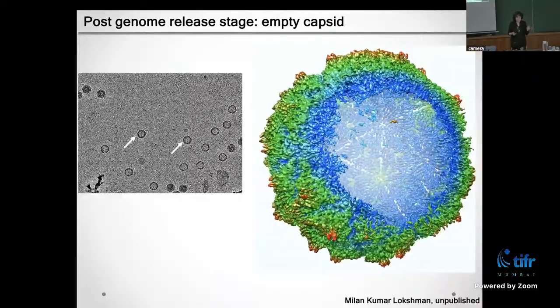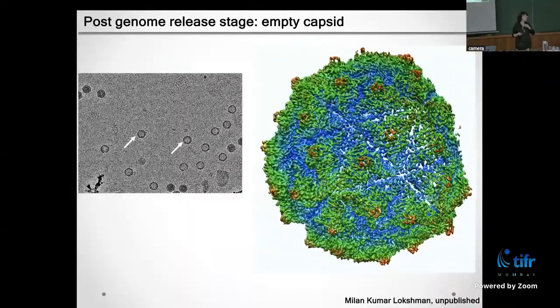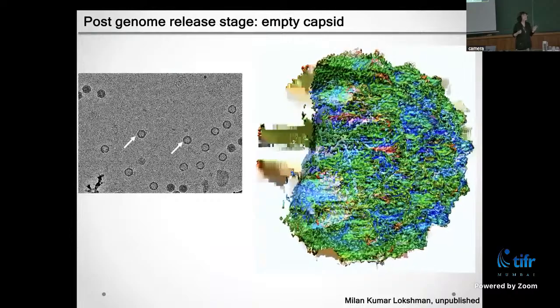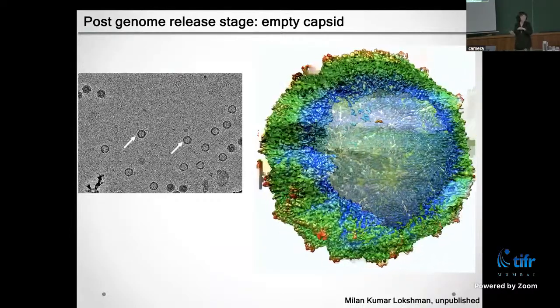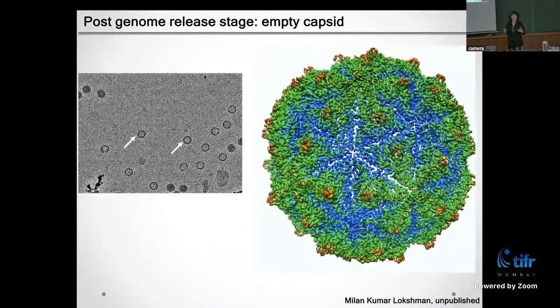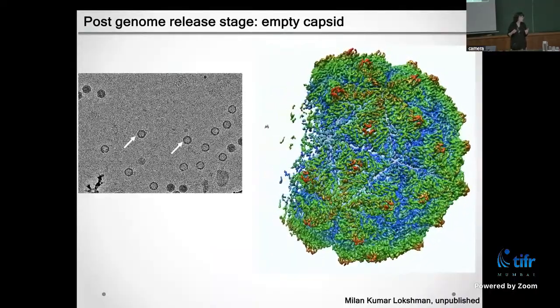This is a huge surprise to us, because all the literature on this particular type of virus says that these are nodoviruses, and they apparently cannot assemble without RNA. We can get virus-like particles of these, but they will just take any RNA from the cytoplasm and incorporate that, so they require charge neutralization for protein assembly.